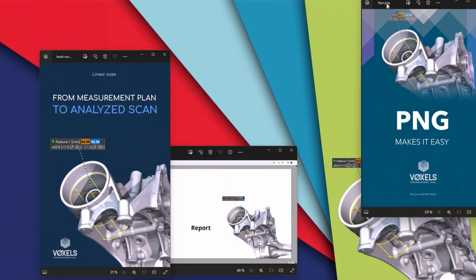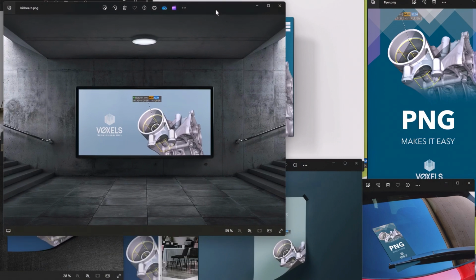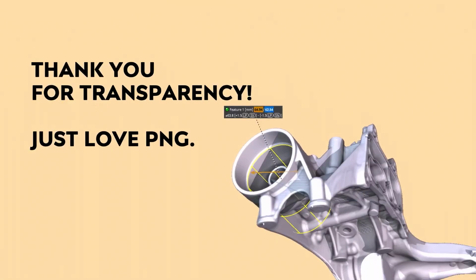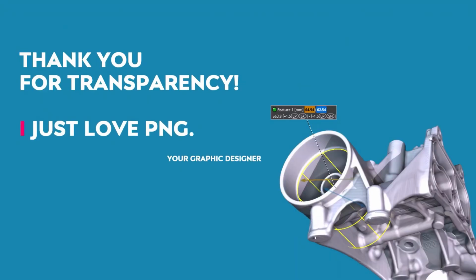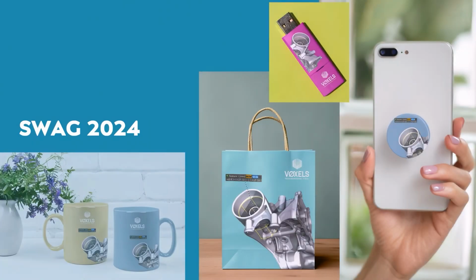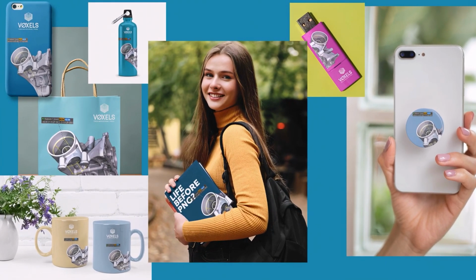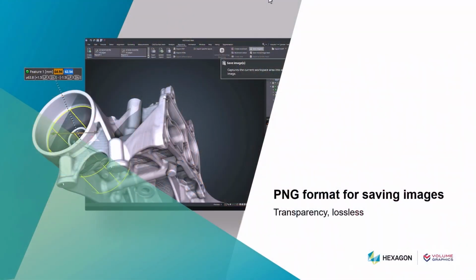Think of reports or flyers, brochures, roll-ups, and posters, or billboards. You will be happy because your images will fit seamlessly into your designs, and your presentations, decks, will look way better too. Your graphic designer will be happy because they no longer have to spend time replacing your favorite gradient with the corporate color. Your webmaster will be happy because they now have complete flexibility with your images. And your marketing manager will be happy because all your swag will look so professional. In other words, everyone is happy with this new feature. And the rest can keep on saving bitmaps. Welcome, PNG format.